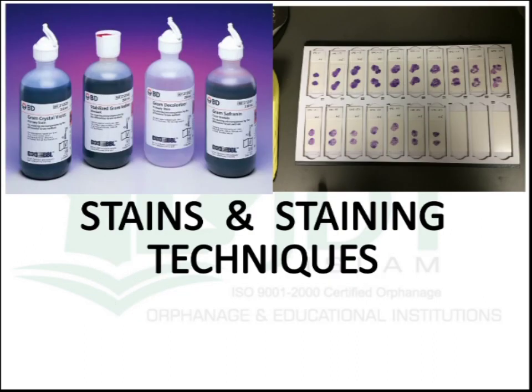Now coming to the important part of this topic, by microscopic morphology: stains and staining techniques. It's an important topic from the examination point of view, both practical as well as theory. Questions seen are to define and classify stains and explain staining techniques, and in the practical examination the major experiment will be to perform the Gram staining procedure and identify the microorganism, as well as study the motile activity of a motile microorganism by the hanging drop method.